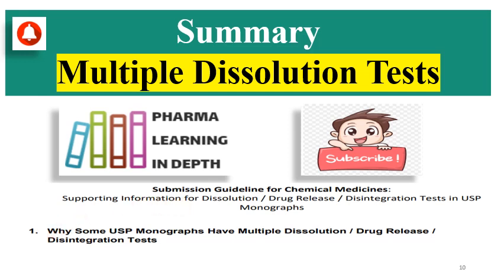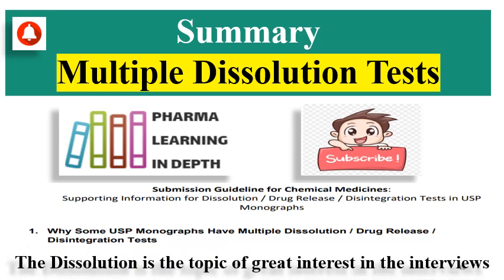Then you might have a question whether only the extended release, prolonged release or delayed release type of formulations have different tests, and is it applicable to immediate release type of formulations? So yes, for immediate release formulations also some different tests are given.